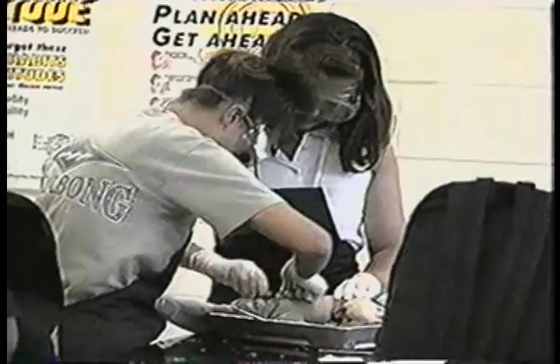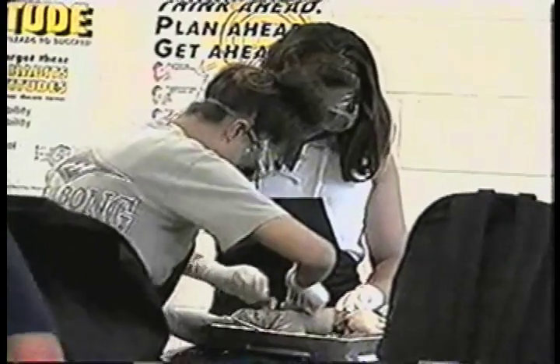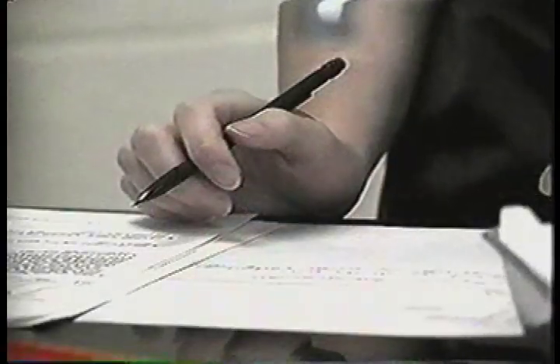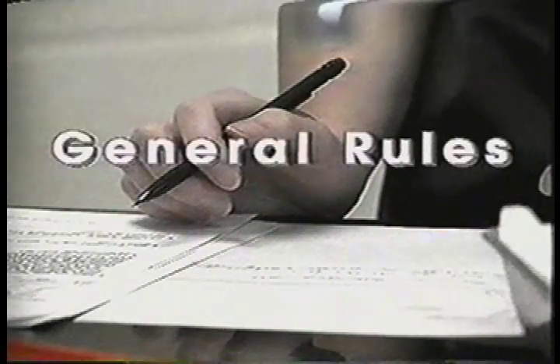Dress the part. Sometimes students in a chem lab will have to be fully dressed in protective gear. Experiments in a physical science lab may not be so demanding. The specific instructions for each situation will be issued by your teacher, but there are general rules you must learn before proceeding with any experiment in the laboratory. General rules. A girl ties back her long hair.